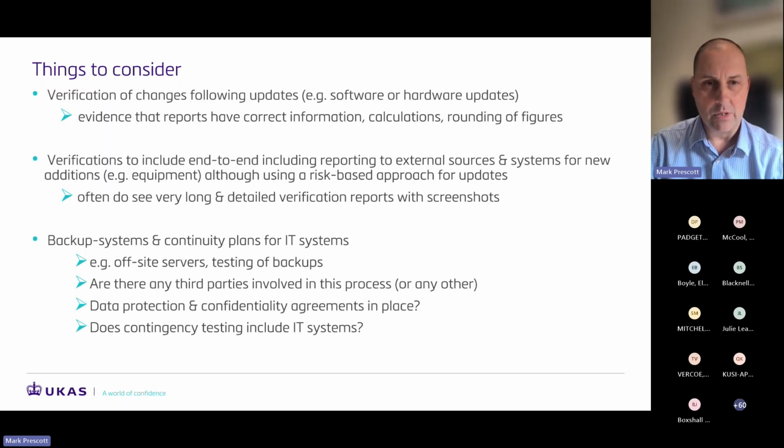I say this has been on the news recently: laboratories needing to go back to paper-based systems. We're very good at doing contingency testing for things like fire and flood, which may well affect the LIMS system. But do bear in mind that you need to consider that.